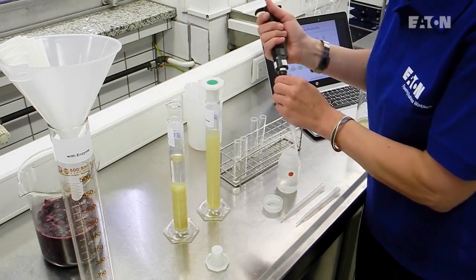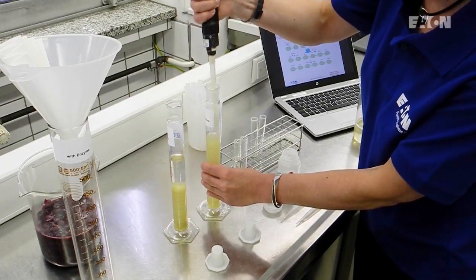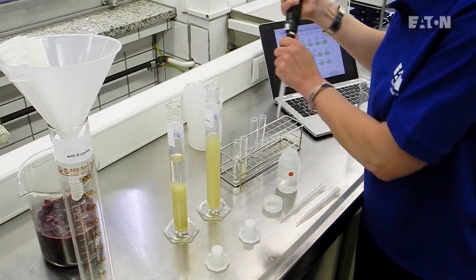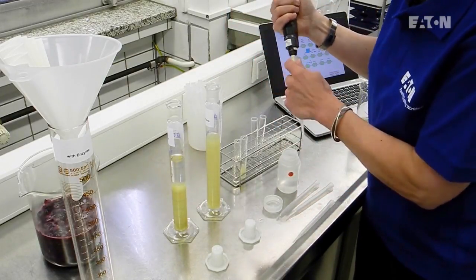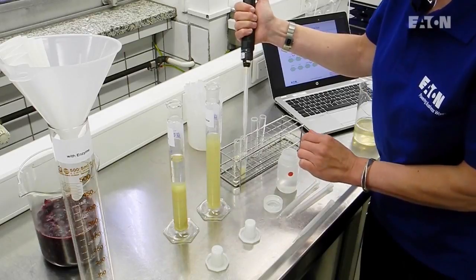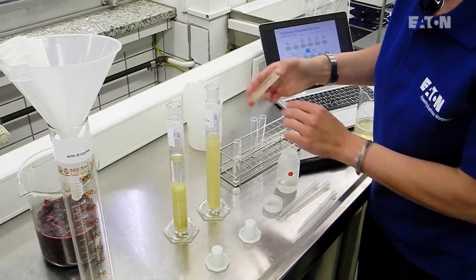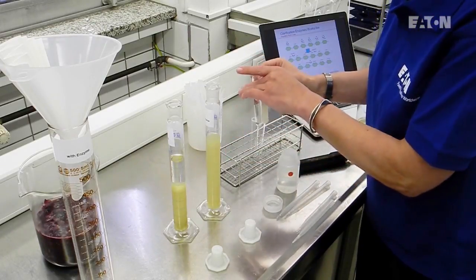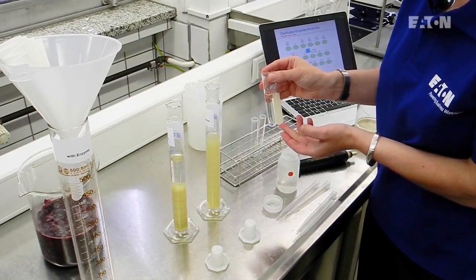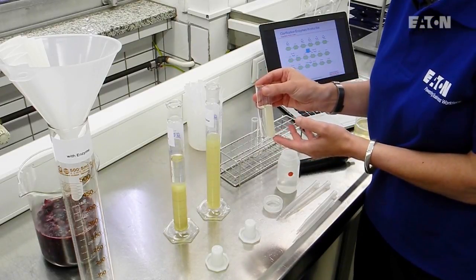We do the same with the unclarified juice, or the naturally clarified juice without any enzyme: 5 milliliters of juice and 5 milliliters of ethanol. We make a small mixing, and then the reaction can start. On the left side we have the sample with enzyme, and on the right-hand side we have the sample without any enzyme. It takes about two minutes, and then we have to wait for the reaction to work out.